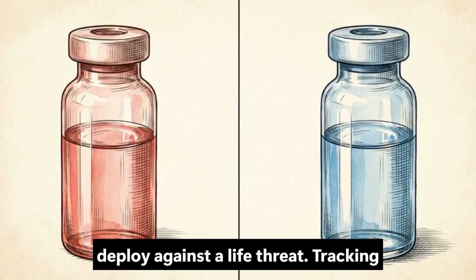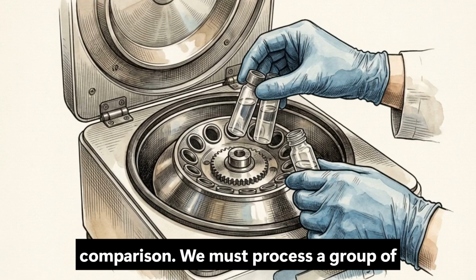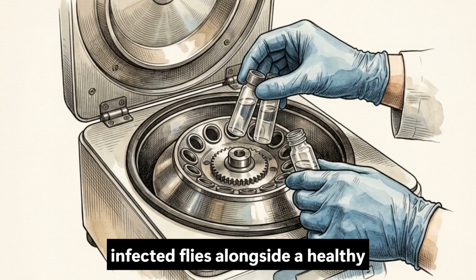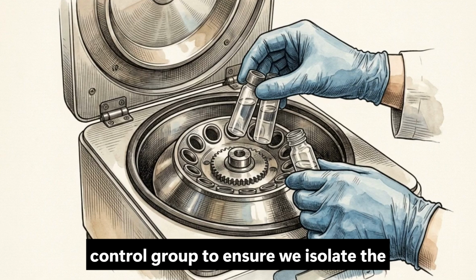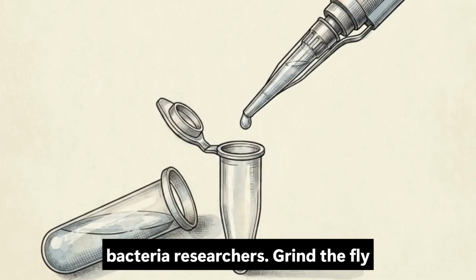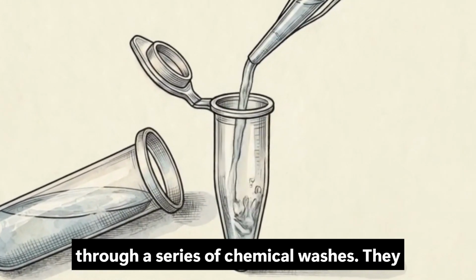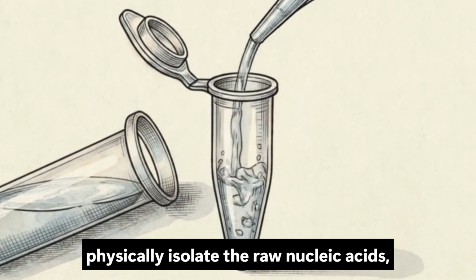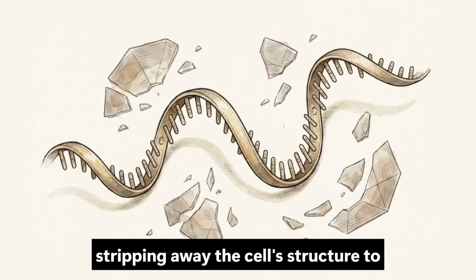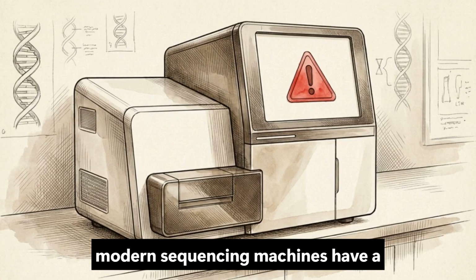Tracking this response requires a controlled comparison. We must process a group of infected flies alongside a healthy control group to ensure we isolate the changes caused specifically by the bacteria. Researchers grind the fly tissue to release the internal components. Through a series of chemical washes, they physically isolate the raw nucleic acids, stripping away the cell's structure to leave only the RNA behind.